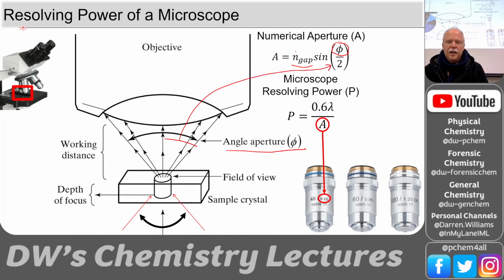Take the sine, and then multiply by the refractive index of the gap. The reason we want to use oil, we'll see in a minute. We change that refractive index and we increase the numerical aperture. Okay, and that makes our resolving power small. The resolving power is sort of like the smallest objects you can tell apart. Like how close could two lines be before you could see light between them? Okay.